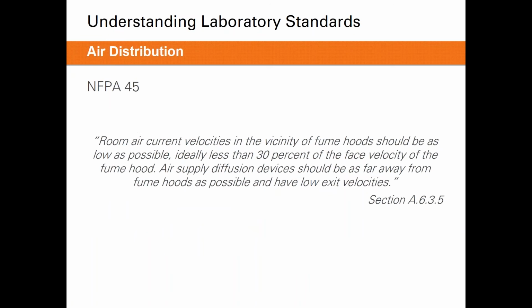The NFPA standard as well dictates that room air current velocities in the vicinity of the fume hood should be as low as possible, and ideally less than 30% of the face velocity of the fume hood. So again, that 30% of the face velocity is where we want to target, 30% or less.